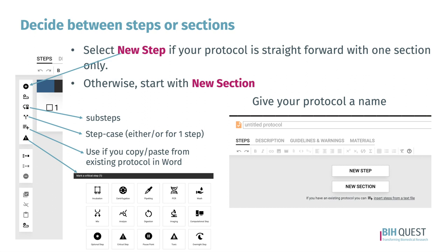Sometimes there are steps where you have more than one option of what to do — for this, use the step-case to present these options. And if you have an existing Word protocol, you can use the copy-paste button, which gives you several options for inserting your protocol while maintaining its structure.